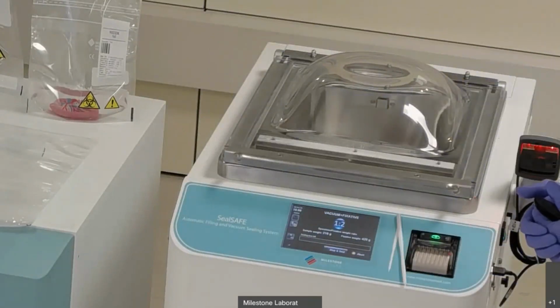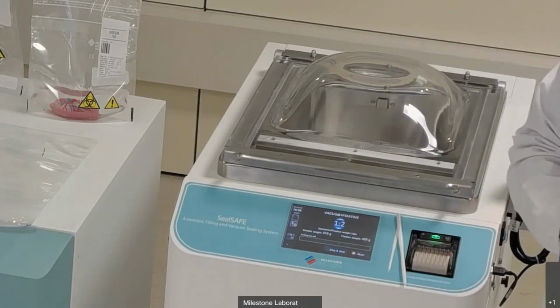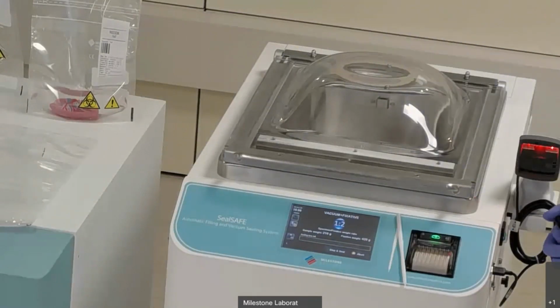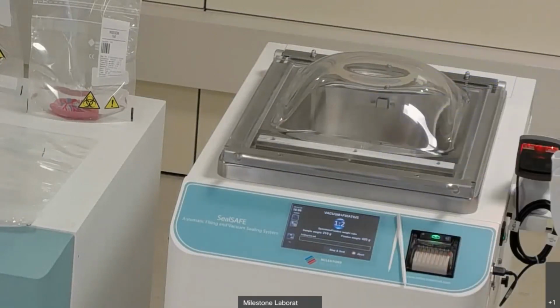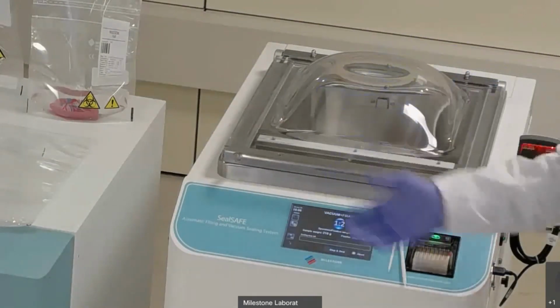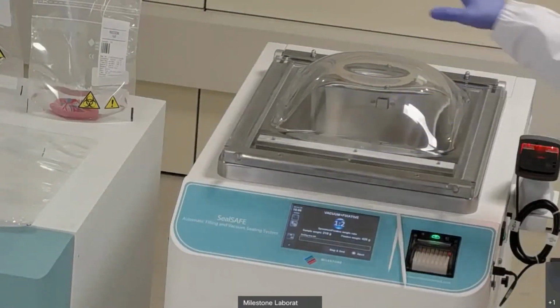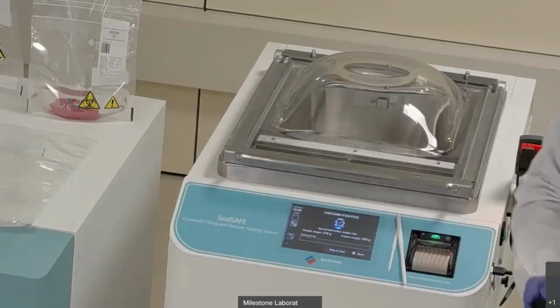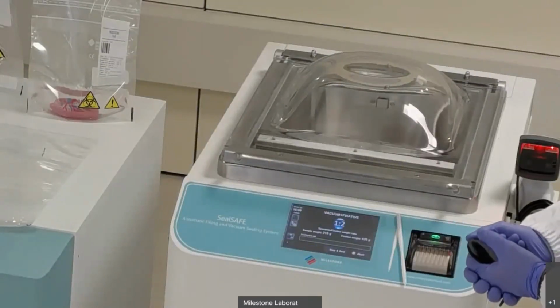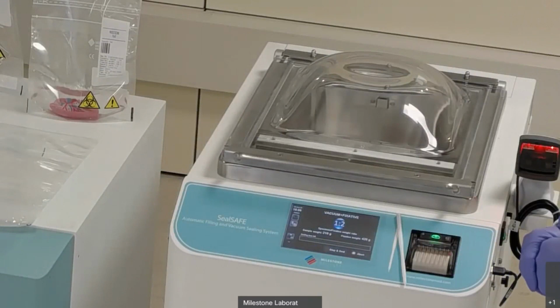Now the procedure is terminated, and the sealing is getting completed. As you can see, up to the end of the procedure, I was never in contact with formalin, because all the dispensing of formalin is taking place inside the protected environment. Now the bar is sealing the bag, and I will get a label with the information.